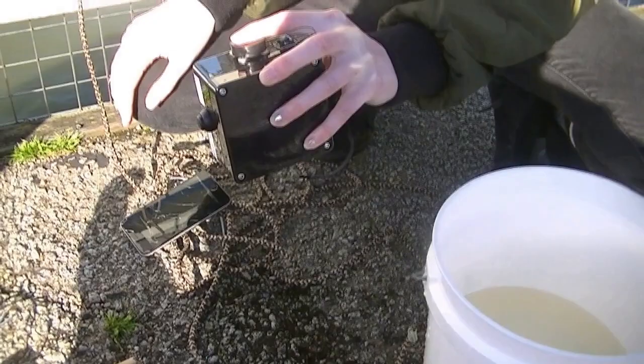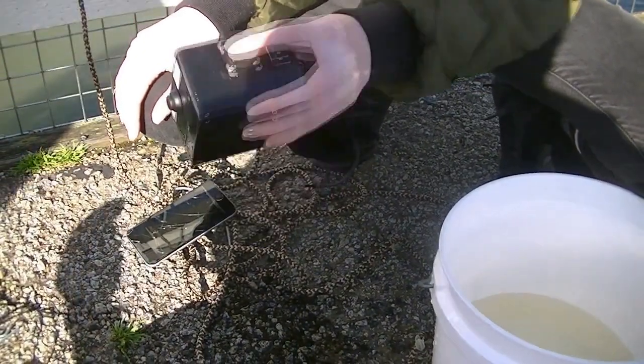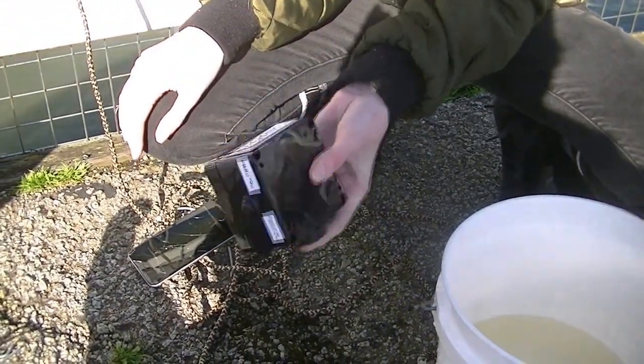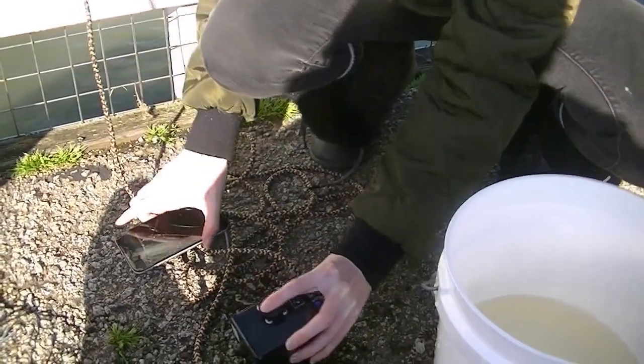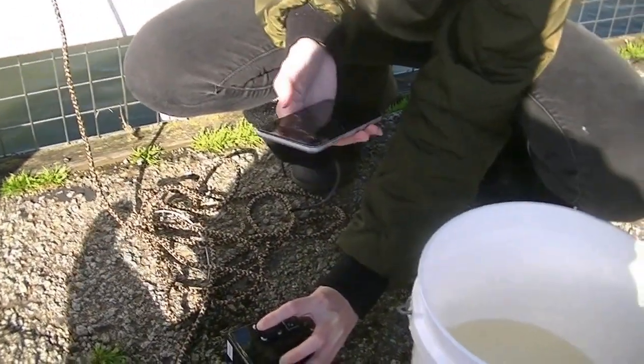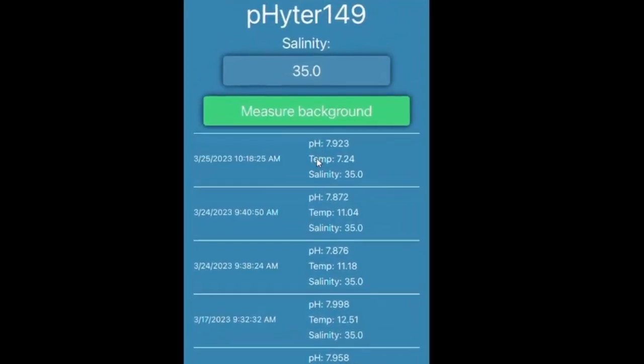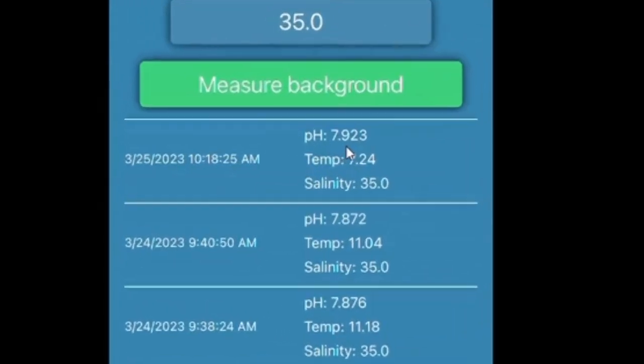Invert the Phyta three times to make sure the indicator is well mixed. After adding the indicator, press measure pH, and we have a pH of 7.92.